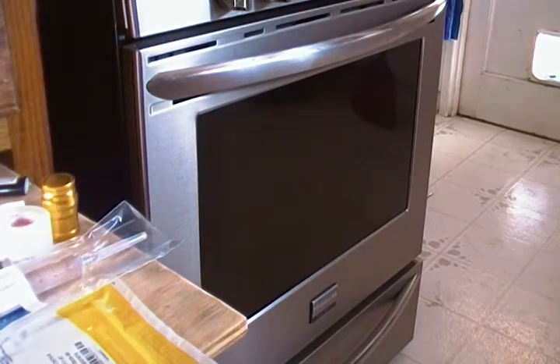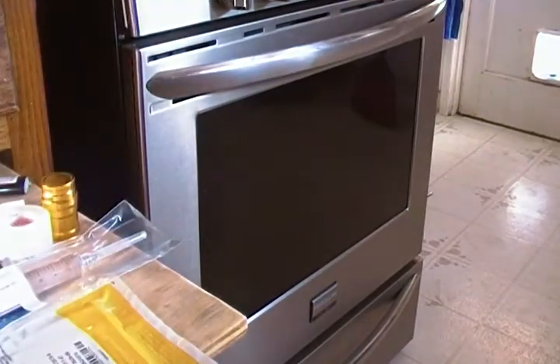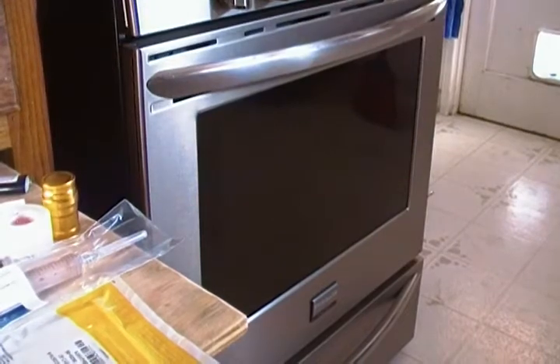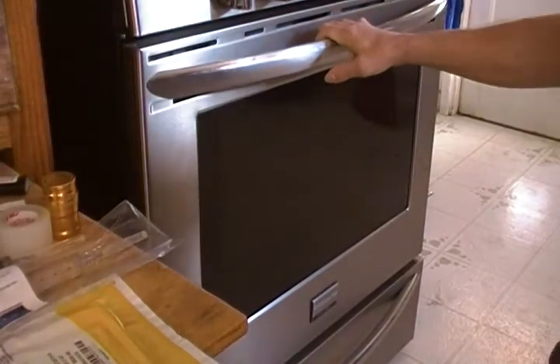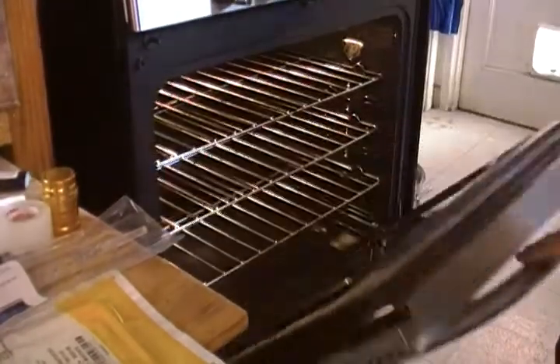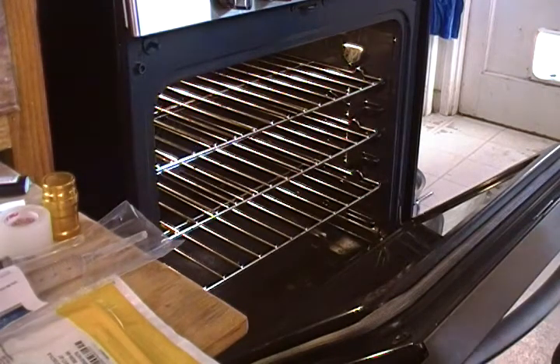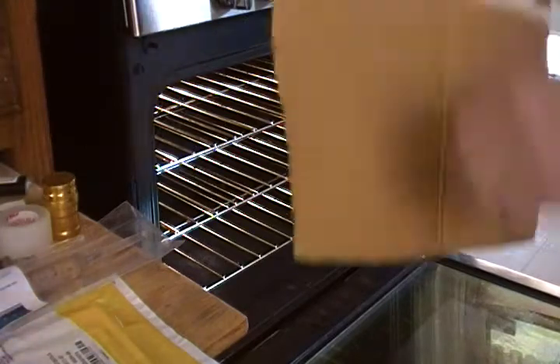Hey, what's up everyone. I'm going to be inoculating some jars today, so I'm getting everything ready. The oven's already preheated — I put it on 375 for 20 minutes, then lowered it down to 275 for 10 minutes so it evens out. At 275 it's not too hot. Get a cardboard piece ready.